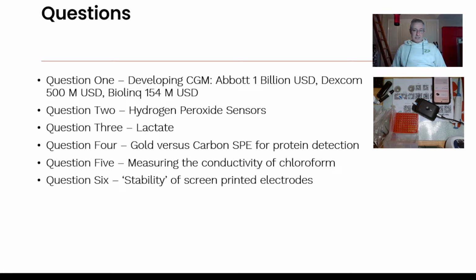Question number 6, somebody's asking about the stability of screen-printed electrodes. It's probably worth saying that if you watch week after week at ZP, we do talk about screen-printed electrodes a lot. And the thing that I keep emphasizing on ZP screen-printed electrodes is actually not the stability. I think I haven't mentioned stability of screen-printed electrodes in an awfully long time.